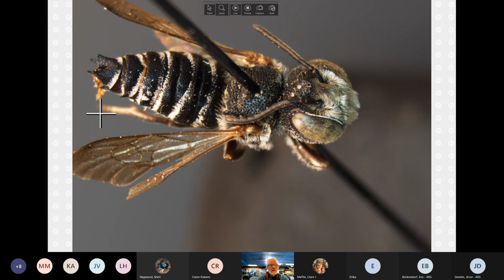And when you look at a new Coelioxys, there's big differences in what this looks like, but they're difficult to describe accurately, so they're not used a lot in separating. But you should always look at what's going on back here to get a sense of what's happening.